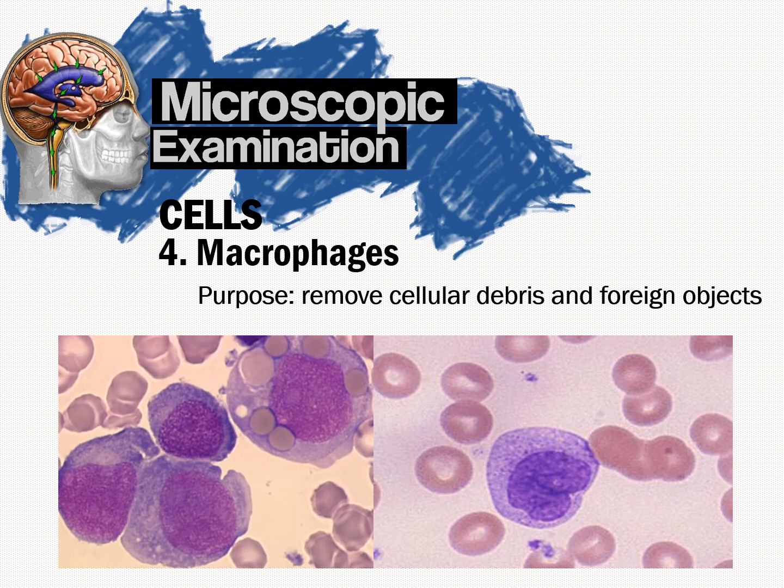Macrophages or monocytes in the tissues are present in the CSF to remove cellular debris and foreign objects such as RBCs. They appear within 2 to 4 hours after introduction of RBCs into the fluid and are frequently seen following repeated taps. Their presence indicates intracranial hemorrhage and may contain hemosiderin or hematoidin crystals. Presence of lipophage, I don't have a picture in my slide, but anyway, these are macrophages with ingested fat may be seen following brain infarct.